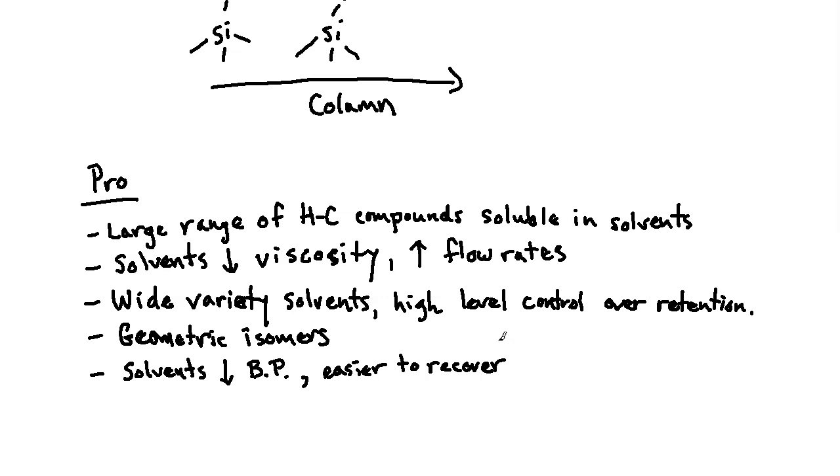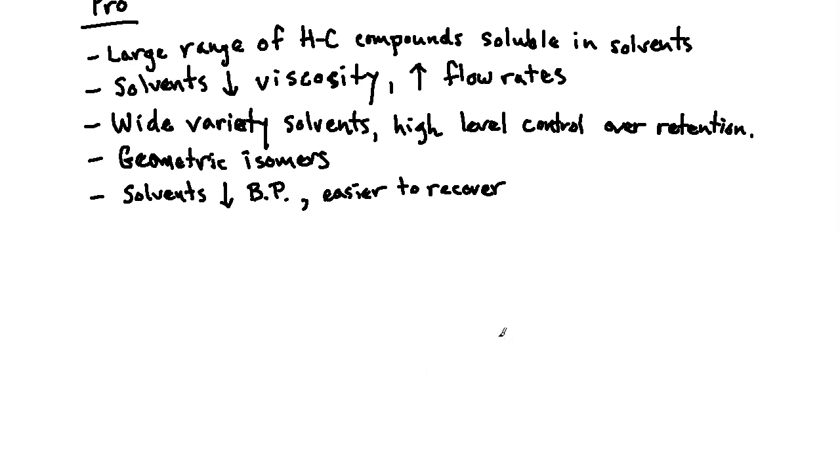And if you were using that solvent to run those columns on, let's say, a weekly basis, a daily basis, that solvent's very valuable to you. You want to recover it and be able to utilize it again, right? Instead of just throwing it into the waste. Obviously, if you're doing something that needs to be excessively pure, you might need to go through multiple rounds of this just to make sure that there's no analyte, especially if you have something that's a lower boiling point analyte, right, that's making it in there. But generally speaking, you are able to recover some of these solvents, which can help ease some of the burden on the pocketbook. Okay, so now some of the cons to wrap this up.